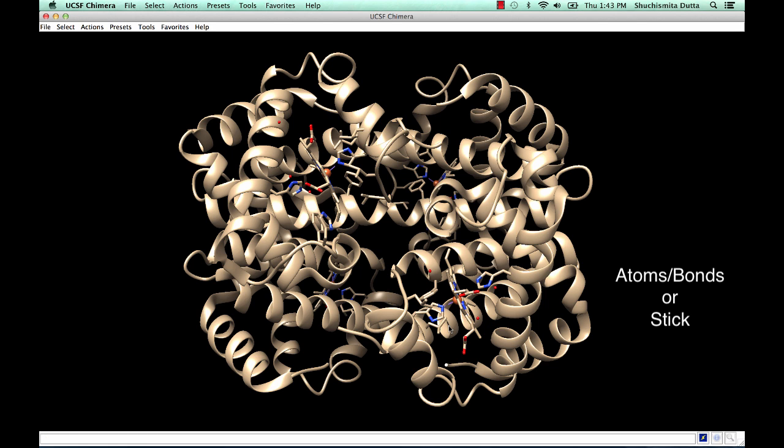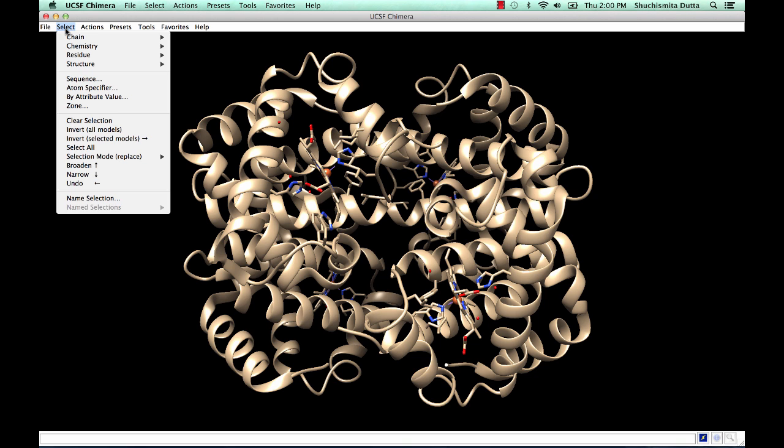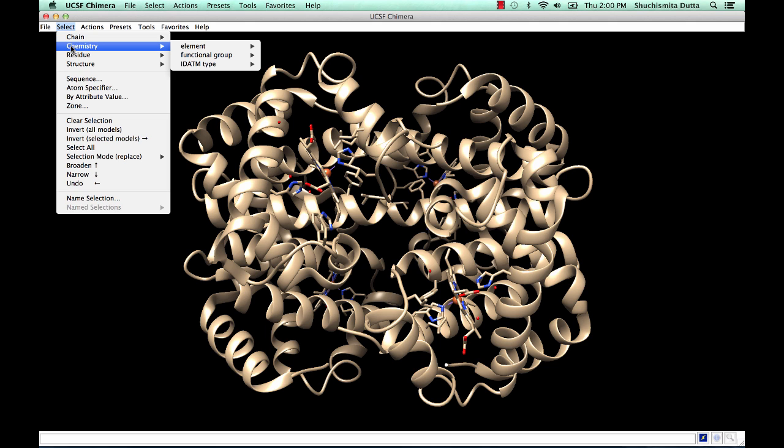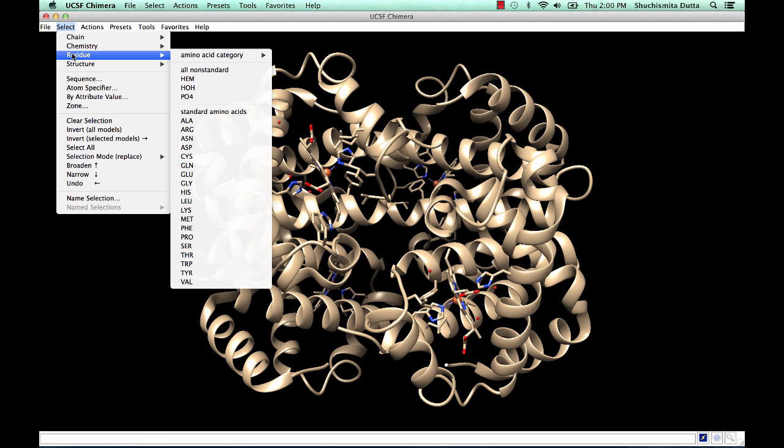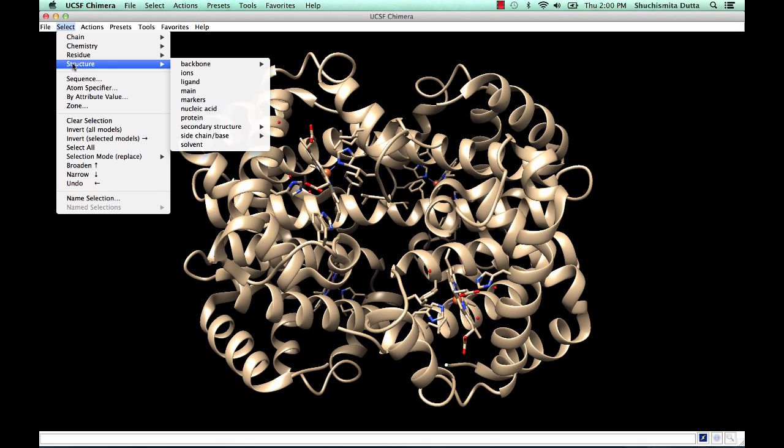Residues around the heme group are also shown in the stick representation, highlighting the interactions between the residues and the heme groups. To focus on specific residues or regions of this protein structure, use the Select menu options. You can select by polymer chain identifiers, by specific chemistries, residue names, and other structural features.